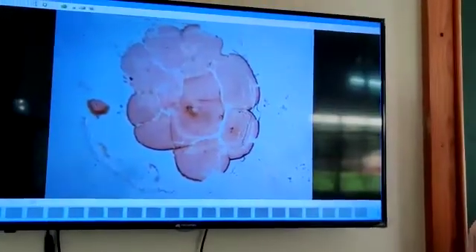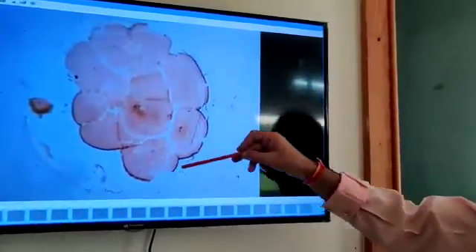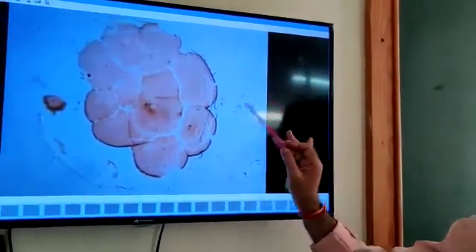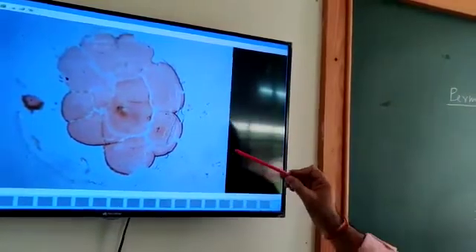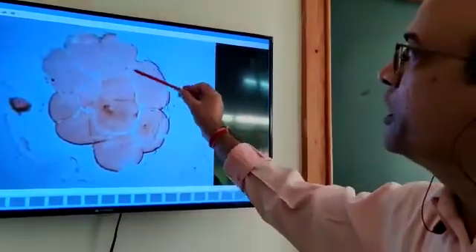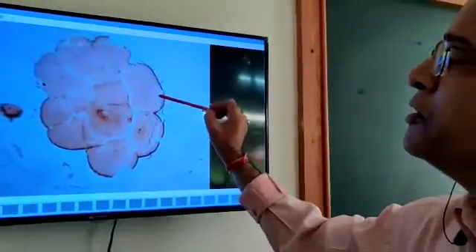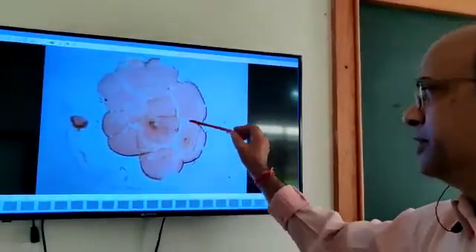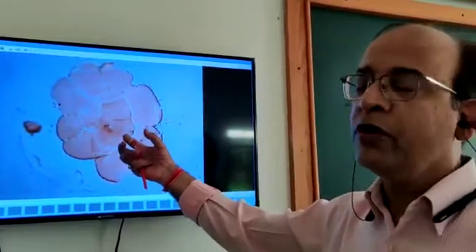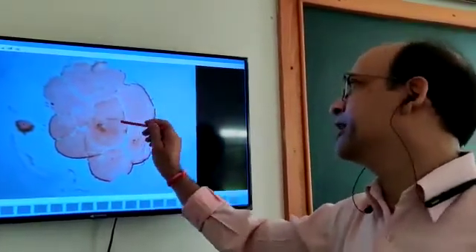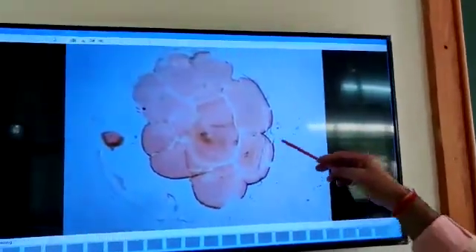Now I am showing you the permanent slide of blastula. This blastula is the blastula of frog, not human blastula. You can see different cells — these are blastomeres, and these cells are formed by cleavage in the zygote. Later on it will become hollow and a cavity will develop inside. That cavity will be the blastocoel. So this is the blastula of frog.